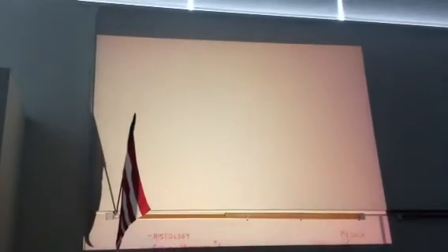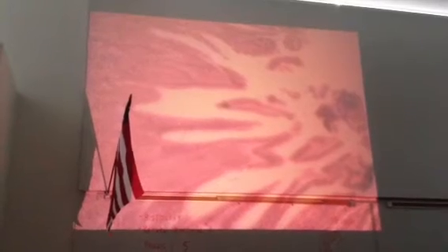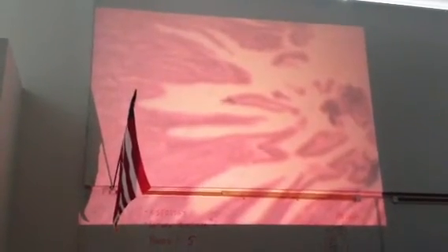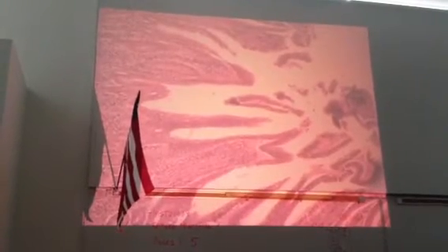If I look for duodenum, okay, the spiky nature to the villi is an immediate indicator that I'm not doing much absorption here, and we don't do much absorption in the duodenum because we haven't finished digesting everything down to monomers.